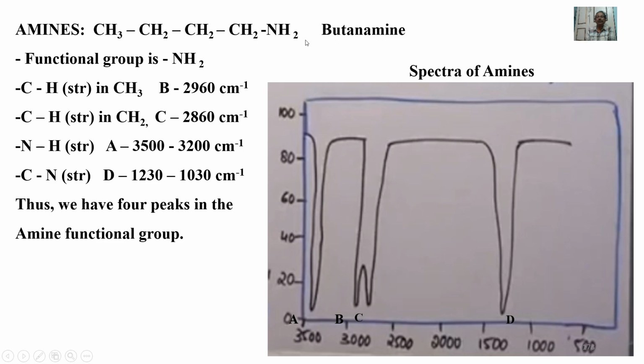And this is about the spectra of amines. So in CH3 we have CH stretch, which lies at 2960 per centimeter.